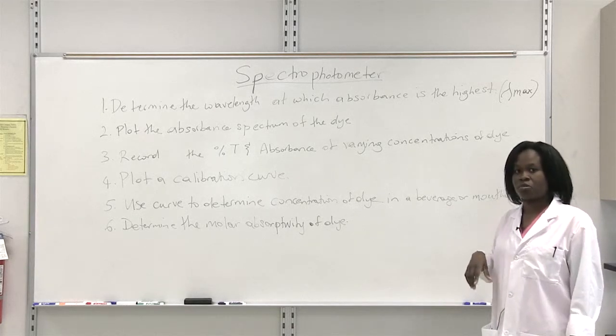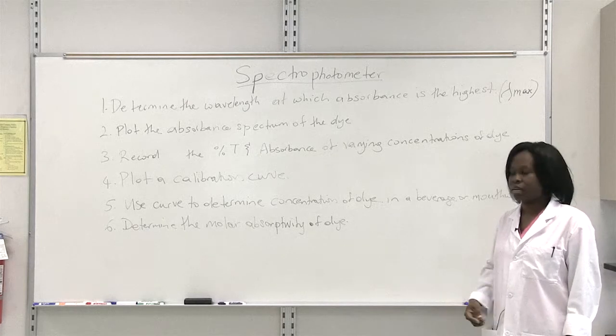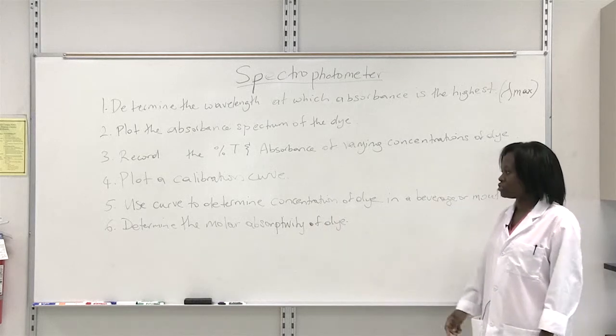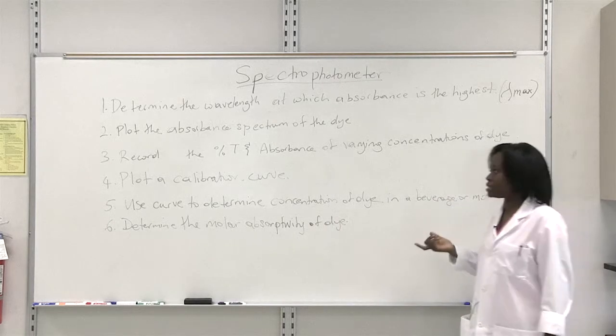The beverage or mouthwash given to you won't have a known dye concentration, but using the calibration curve, you'll be able to determine it. I'm going to use a mouthwash as an example.